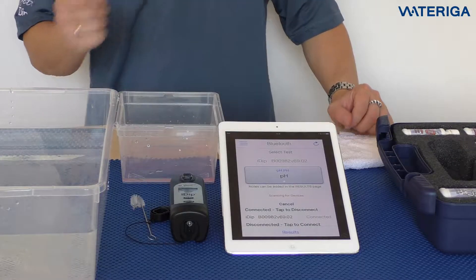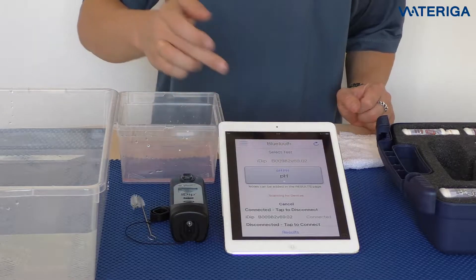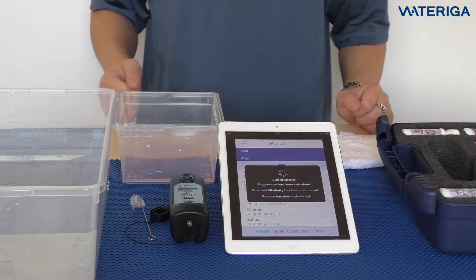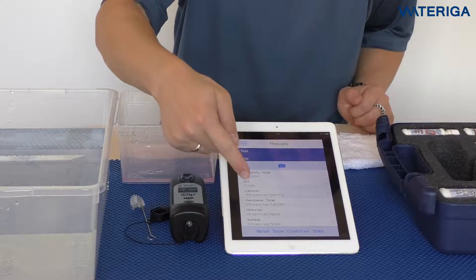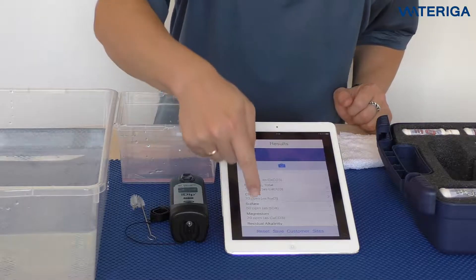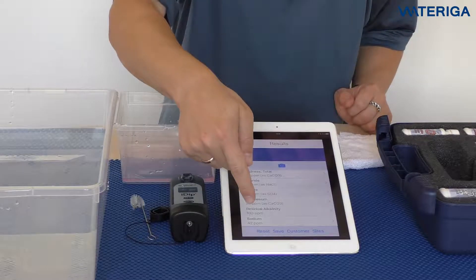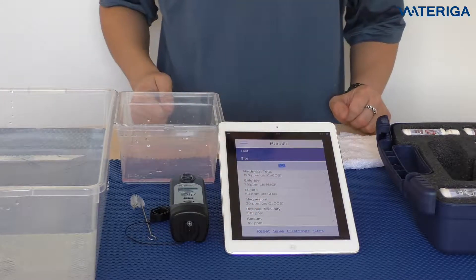Now that we've done all six tests, we can go to the temporary results page by hitting the results button. As you can see, three results are being calculated automatically. We did alkalinity, pH, calcium, total hardness, chloride, and sulfate from our Smart Brew kit. And then we got magnesium calculated, residual alkalinity calculated automatically, and also sodium calculated automatically.